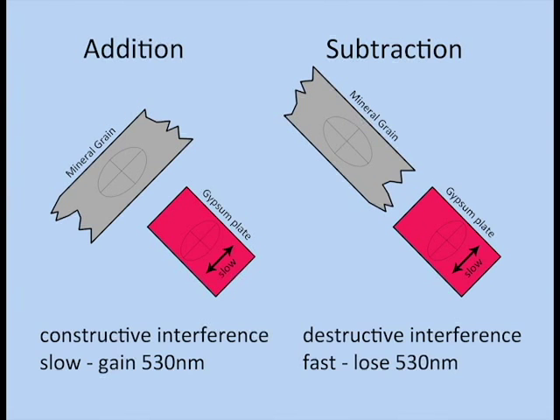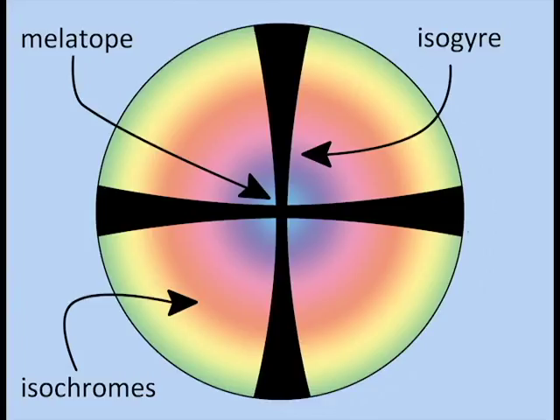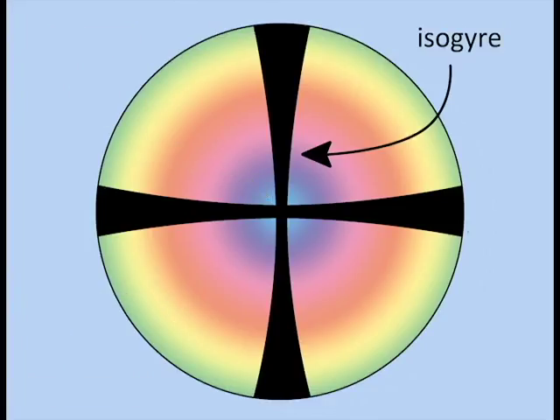Here we see a typical uniaxial conoscopic figure. The isogyres are the black lines where extinction occurs. This occurs because the light vibrations are parallel to the vibration direction of the polars.